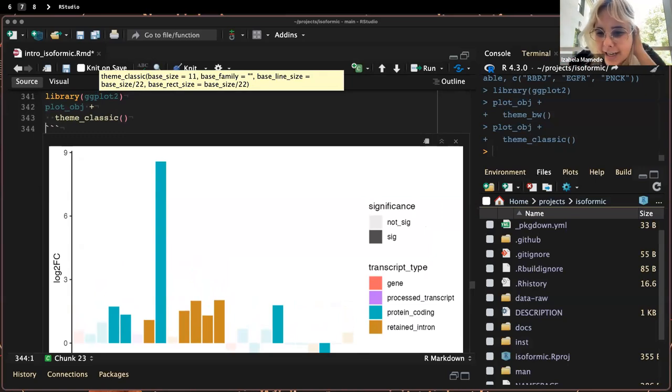I have a question on chat. All right, there are no stupid questions, Joy. Let me see. Are the reads coming from a specific tissue? Biologically, I'm guessing that differs across tissues. So with regard to public data, if we wanted to practice what you're teaching, we'd want to look for data related to specific genes for a particular tissue type.